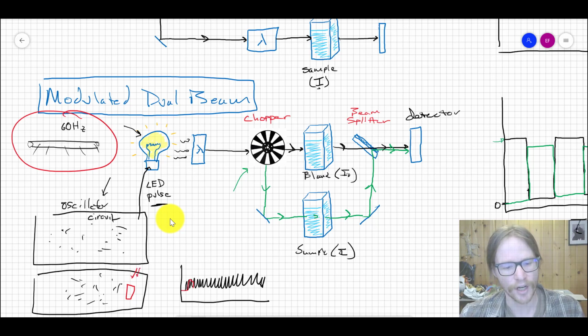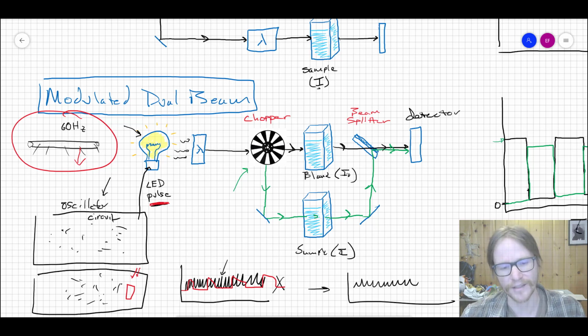And so what you have is a superposition of two signals, where you have the light that you don't want because it's not coming from your spectrometer. That's interference. We want to zap that out. And then you have your actual signal, which is in black here. The last thing you do on this detection circuit is you build a passive frequency filter or cutoff filter, which allows only signals of a certain frequency to pass. We build this thing called a high pass filter, which only allows the black signal to pass. It squashes the red signal, and so what you end up with is a circuit that looks like this, and then we do some more post-processing of that and we get this nice signal.